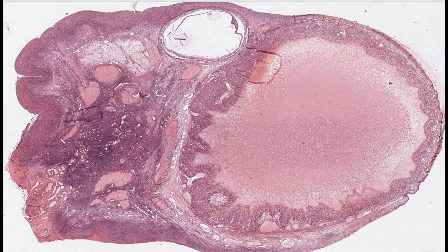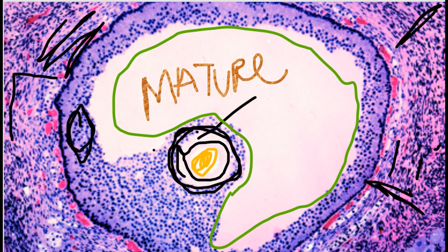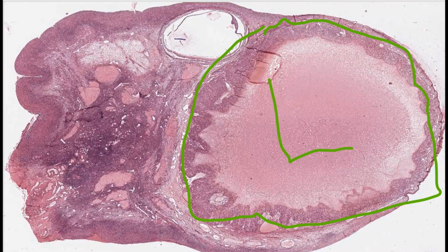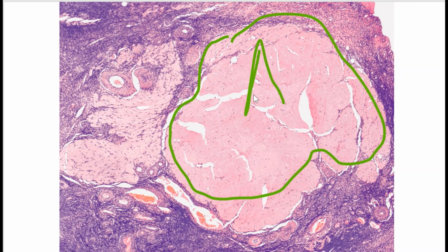So when we're looking at the structure here, this would be the ovary. This right here, all of this would be your corpus luteum. Huge. Okay? It's huge. So if you can remember, when this guy here ovulates, his follicle then fills with blood and blood clots and turns into the corpus hemorrhagicum. Then it becomes the corpus luteum. And then the corpus luteum turns into the corpus albicans.